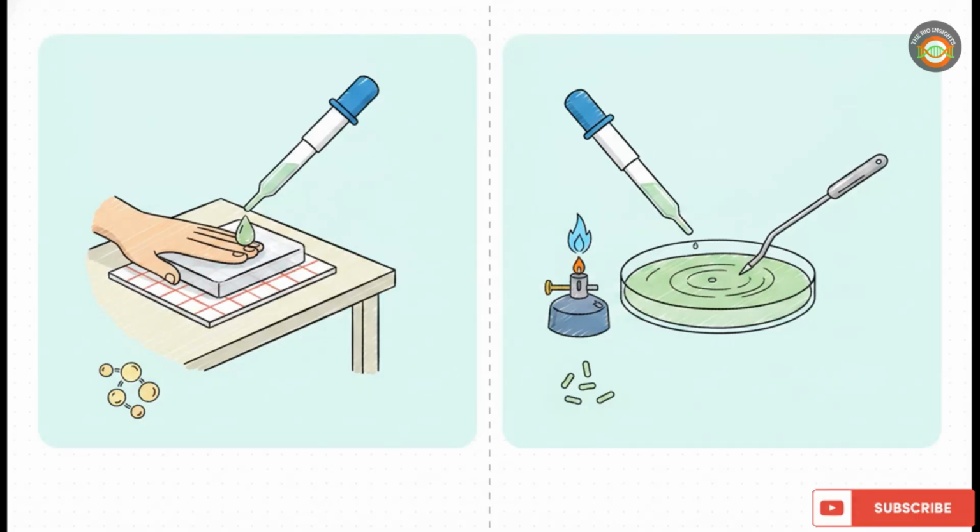Now, comparing these methods really builds a larger picture of how lab methodology works. We've explored two very distinct plating solutions today. On one side, we have Dr. Monica plating yeast. Because of the rapid Petrifilm she uses, she plates a full 1 milliliter and simply presses it flat using a small plastic stomp device. But on the other side, Stephanie is plating bacteria, using just 100 microliters on traditional agar, which requires that thrilling flame sterilization and careful swirling technique.